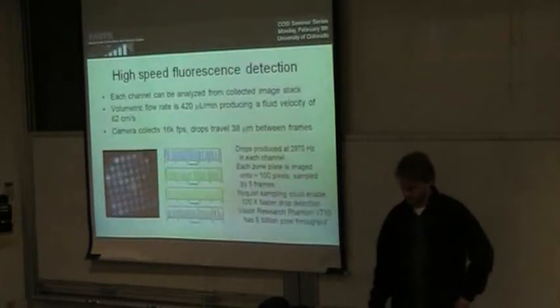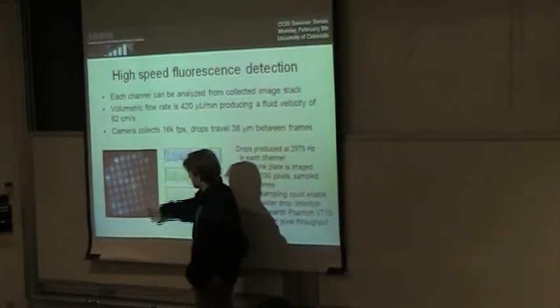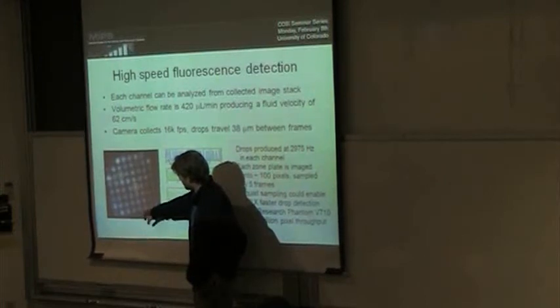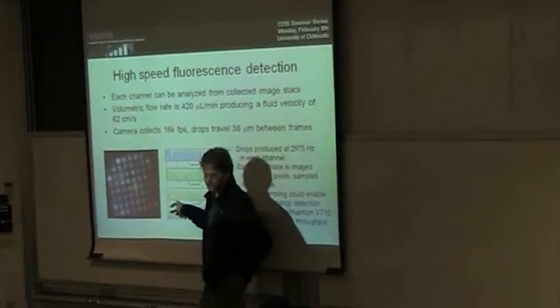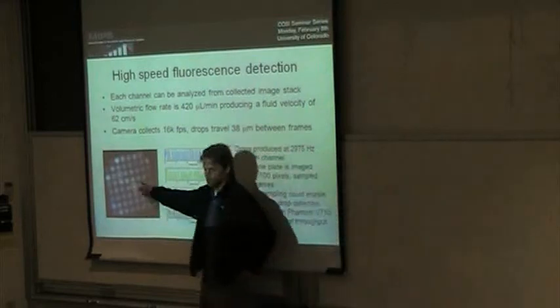So this image is taken by I take my image stack and then I just add like 1,000 frames together. There's several pixels inside each image of the zone plate, and then I integrate all these pixels to get these signals. I was just thinking like if you had some additive noise, like just Gaussian noise or something like that, that just doesn't seem like the optimal situation versus just integrating all that onto one pixel. I don't really understand. Integrating this entire image onto one pixel?